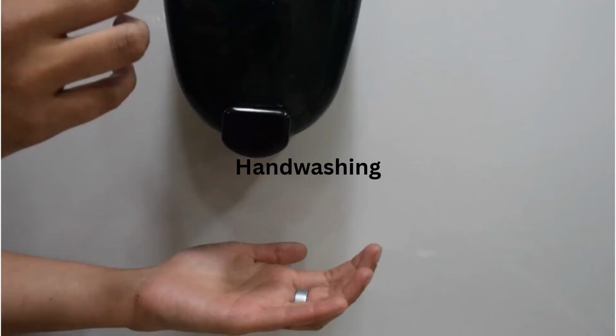Actually, this video is a little short, but there are a lot of videos online, class, that show proper hand washing, which includes scrubbing of your fingers and fingernails. So you have to follow that. Don't worry, I will be uploading a checklist for this so that you have a guide.